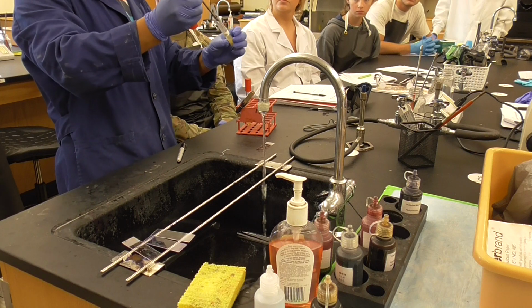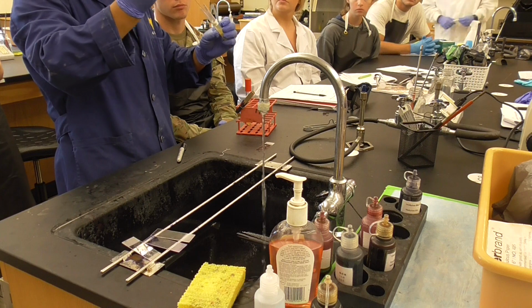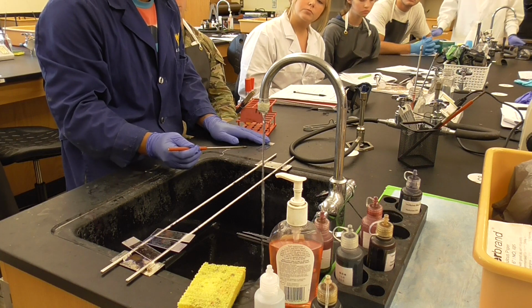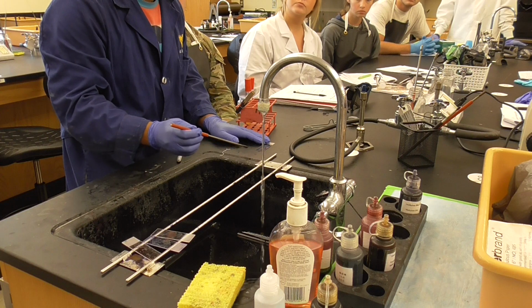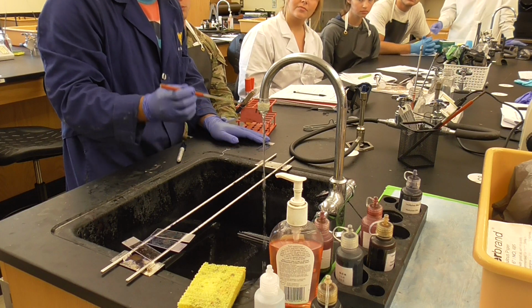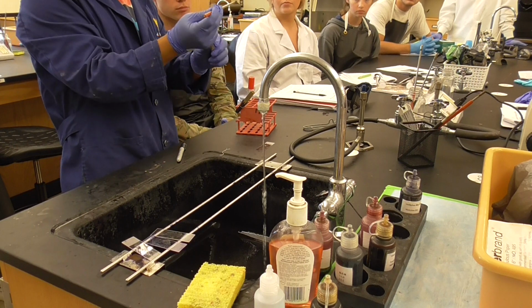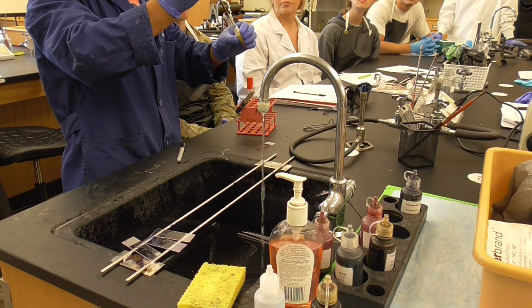And then cool it down on the side a little bit. So you pick some bacteria. Picking a little bit of bacteria is enough. So we're going to make a smear. Okay, now you're going to flame and use the loop, and you're going to pick Bacillus. Flame it, pull down, and pick bacteria from here.